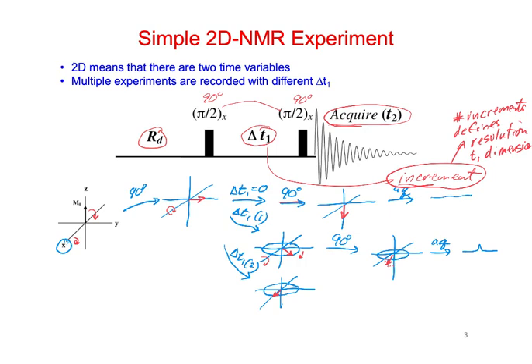So I think we tell it how many increments, and then the spectrometer kind of sets up how much that time delay is. And probably, I can't remember really, T1, obviously you don't want T1 to increment over a longer time period than T2 is, right? Or you're going to be incrementing out beyond the point where there's any signal left, essentially.